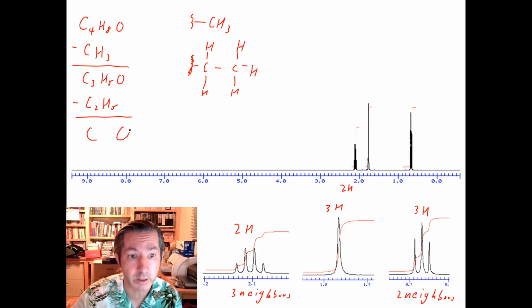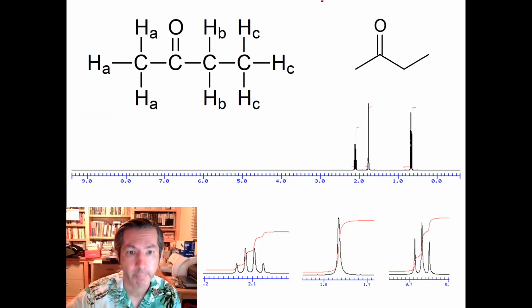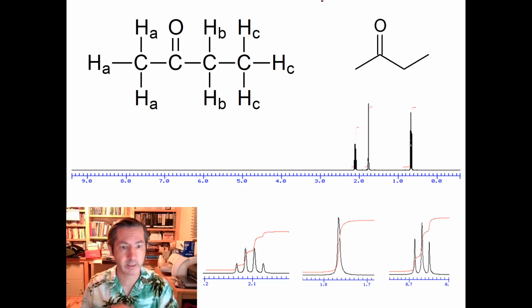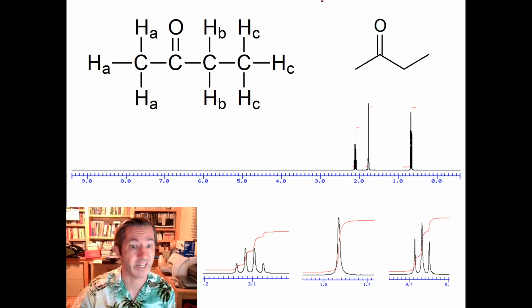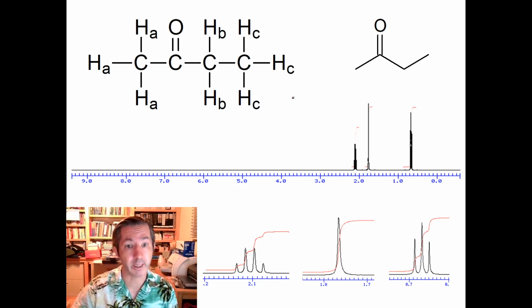It only leaves us with carbon and oxygen. So the last piece of our puzzle has to be a CO double bond. That's our compound right there. We just put these 3 pieces together, and there you go. This is called methyl ethyl ketone. You can actually buy this at Home Depot or Ace Hardware. It's a common paint stripper, good all-purpose solvent there. And now you know what the NMR spectrum looks like. And so that's where the splitting helps.